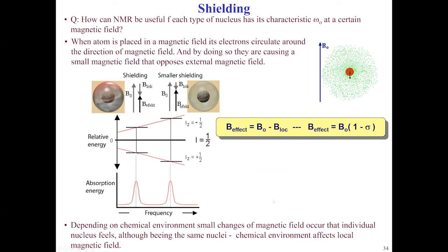So what was discovered early on is that the electronic clouds around a given atom that gives an NMR signal can be of different shape, more or less, I will use the term populated. And of course electrons circulating or tumbling, or whatever you would say, create a little local magnetic field that might oppose or add to the external magnetic field.